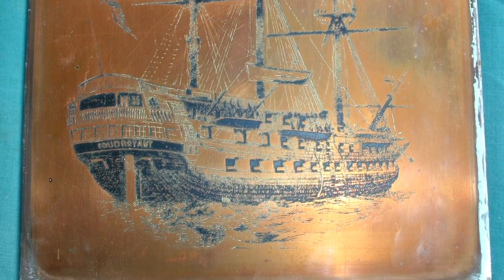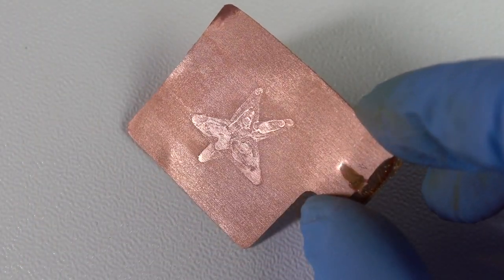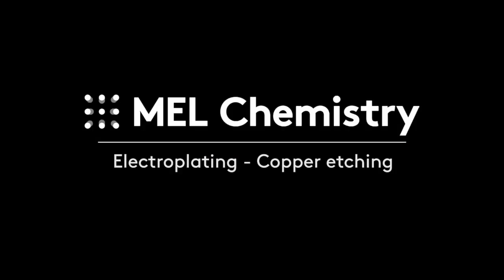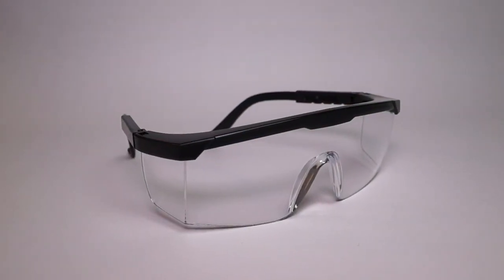You might probably have seen beautiful batch reliefs on the surface of a metal object. With little chemistry knowledge, you can make such patterns by yourselves. Today, with the help of MelScience Electroplating Set, we will paint a copper plate.